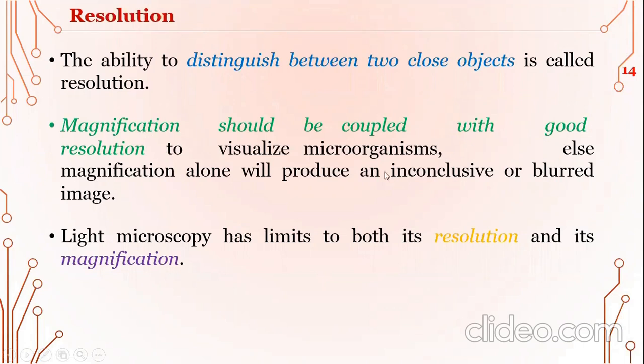If we increase the size of things to make them more visible without resolution, the image becomes blurred, just like enlarging a picture.